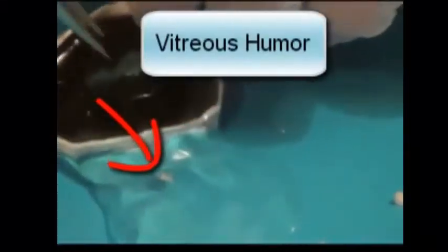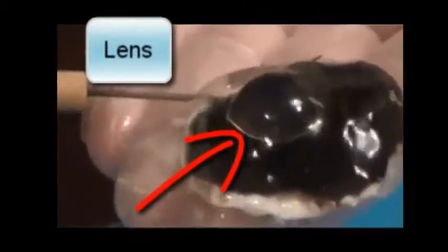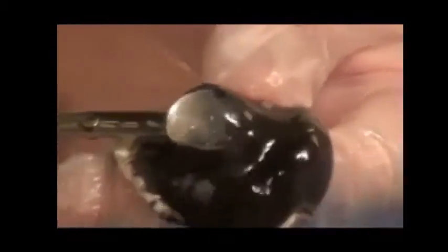Now that we have taken the two pieces apart, let's observe the top layer first. This clear, jelly-like substance filled in the posterior cavity makes up about 80% of the mass of the eye and gives it shape — this is called the vitreous humor. Now we have inverted the eye and removed most of the vitreous humor. The sturdy structure here is the lens. The lens is normally easy to remove and has an opaque color if preserved; otherwise it is clear and connected to the ciliary muscles via eye ligaments. The lens is attached to the ciliary body, which contains the aqueous humor and muscle fibers that change the shape of the lens.